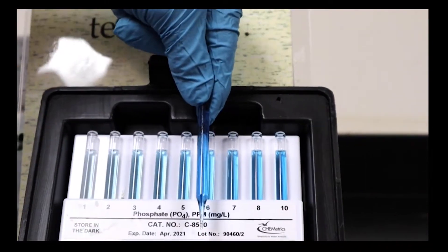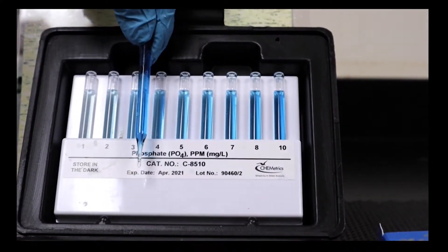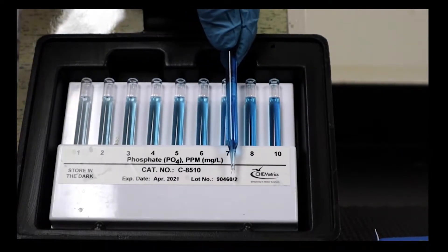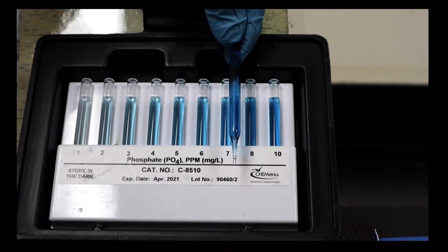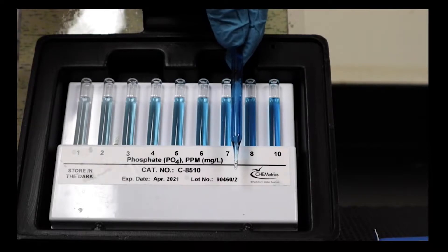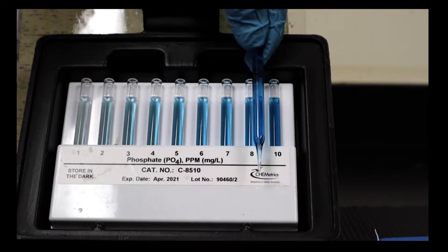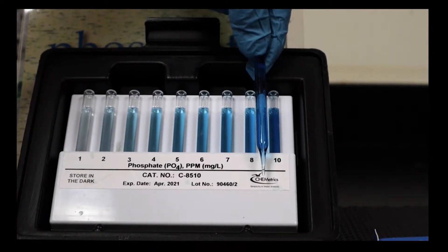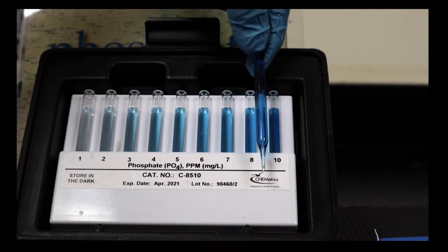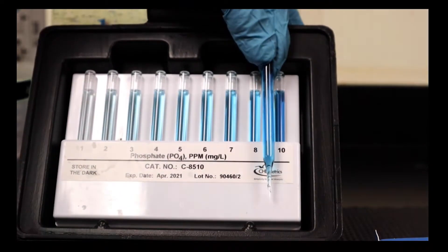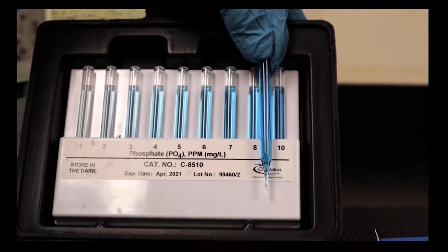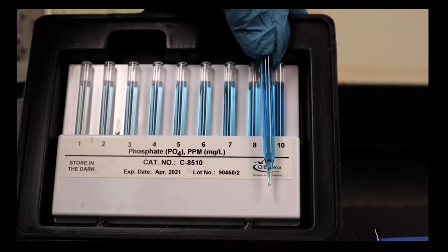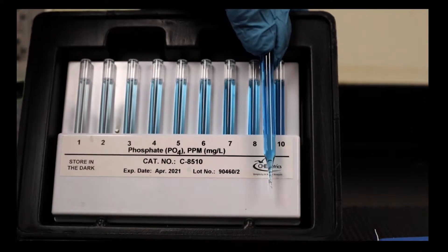So what would you say the match is? Clearly it's darker than this, darker than this, darker than this. What do you think? Maybe a little darker than this? We're pretty close to being right around in here, and I'd say that is most of the way to what's in color standard 10, so it's probably about nine and a half parts per million in sample A.